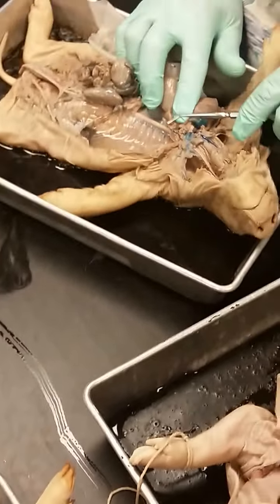Got it? On either side of the urinary bladder, this one didn't get injected, but these are called umbilical arteries. And remember, this is a male, so right there is the vas deferens. Right here, coming off the abdominal aorta, which you can see that white structure. Everybody see that? This would be a testicular artery. And you can see how they converge with the vas deferens.